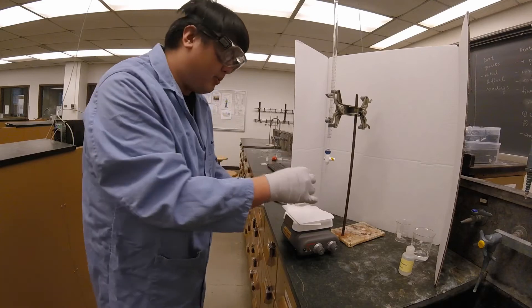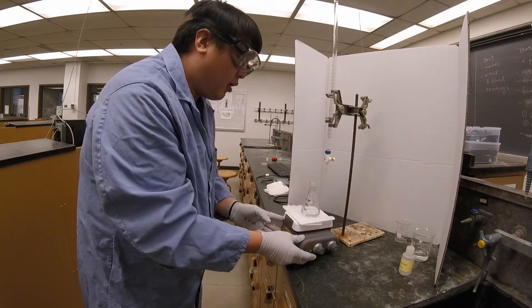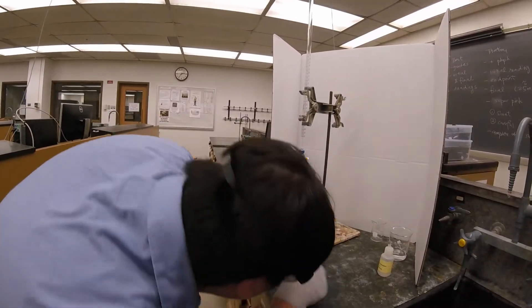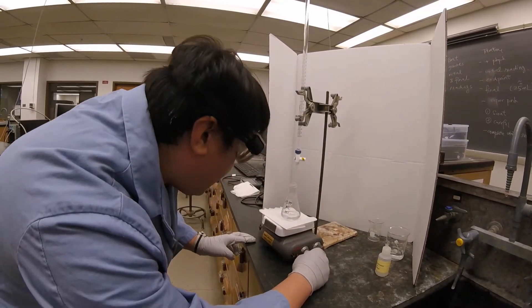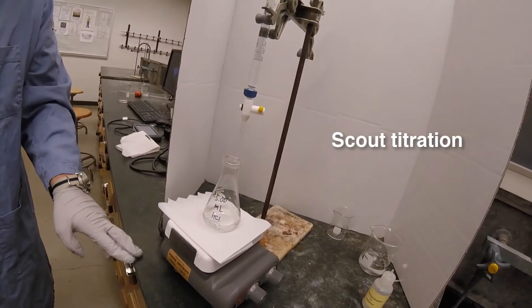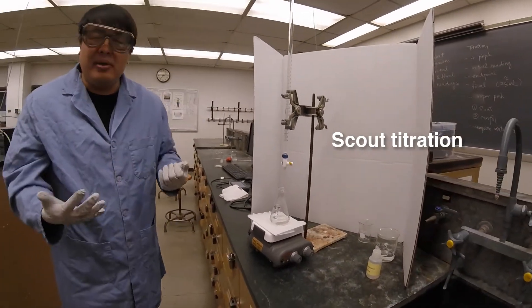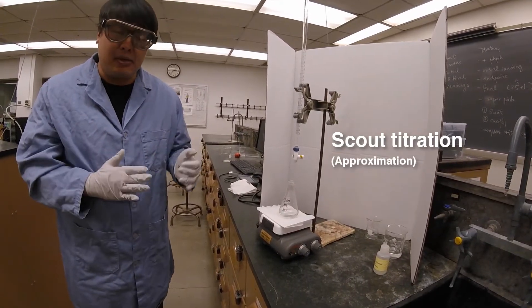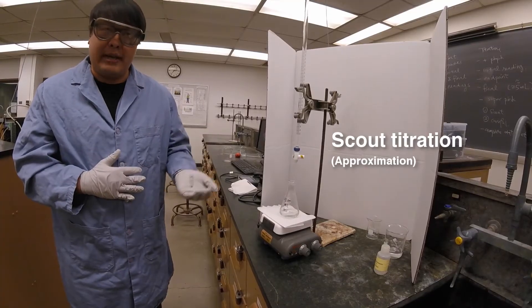So once you've added your indicator, you're going to put the Erlenmeyer flask on the stir plate and make sure that the setting is on stir. What we're going to do right now is a scout titration. Right now our volume is approximately eight mils, and we're just going to figure out approximately how many mils it will take for us to reach the endpoint.